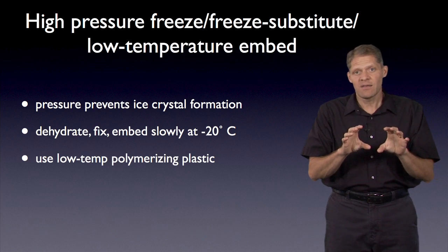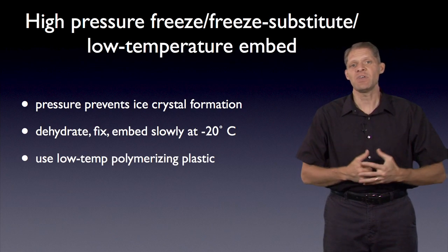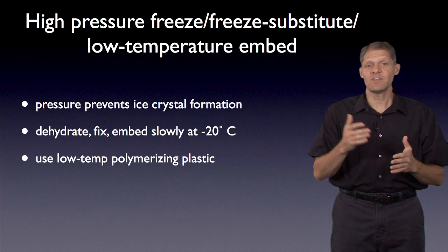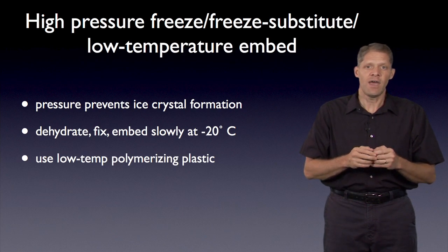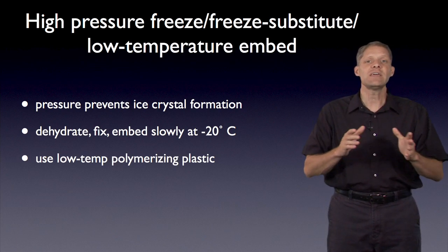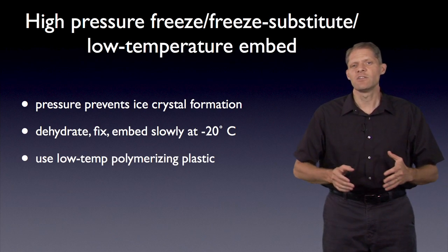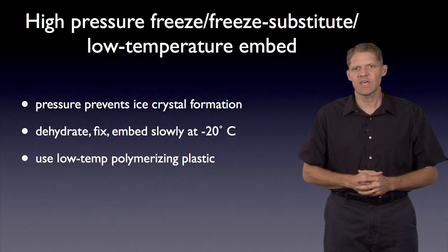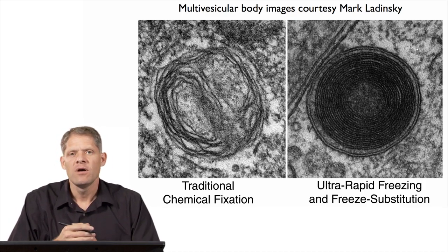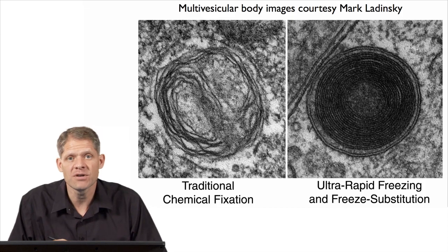Once it's plastic embedded, it can be warmed to room temperature, sectioned as before, typically stained, and then imaged in the electron microscope. Now, of course, if it's plastic embedded and sectioned and stained with metals, again, the actual biological macromolecules will not be seen. It will be the stains that delineate them. But nevertheless, by high pressure freezing, freeze substituting, and low temperature embedding, the basic structure of the cell is better preserved. These two images show an extreme example of how high pressure freezing and low temperature embedding can better preserve cellular structure than chemical fixation alone.